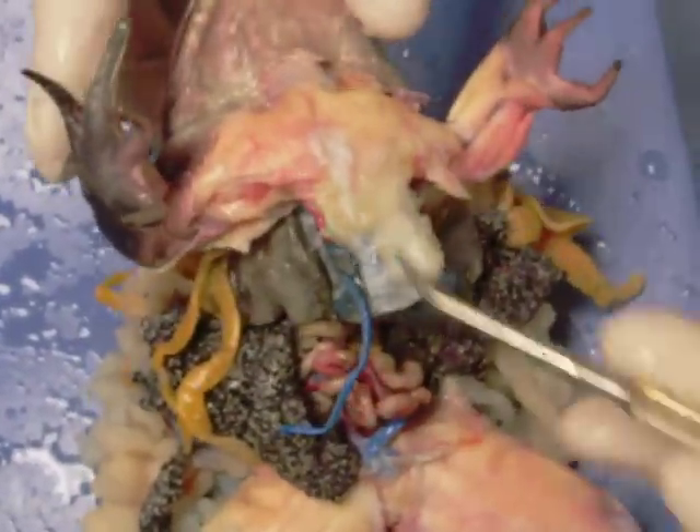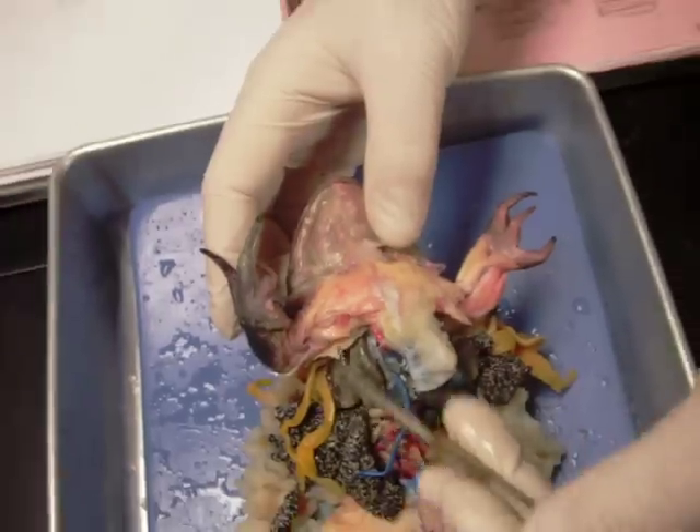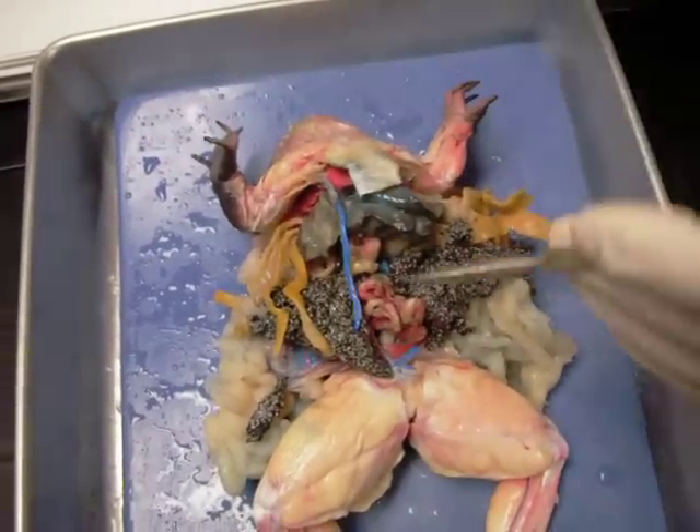A muscle that we missed before: here's the pectoralis. It comes across like this, and there's also a longitudinal section to it — but of course that's been removed as this frog has been dissected, so that piece is indeed missing. We also missed the deltoid, but it's not being shown properly on these specimens.